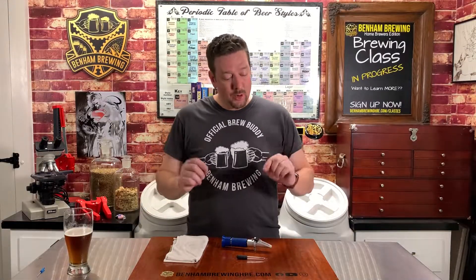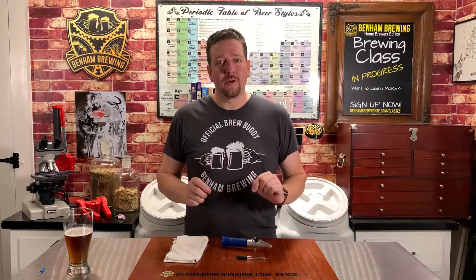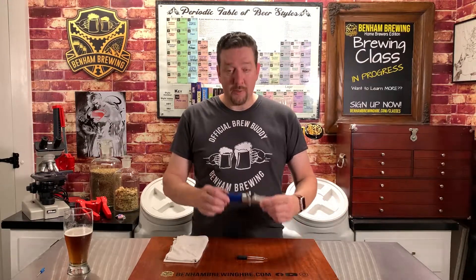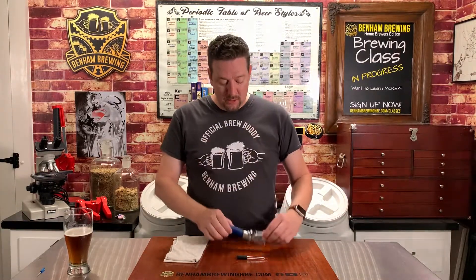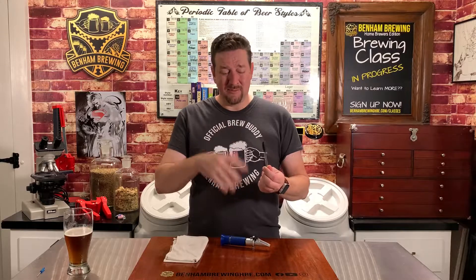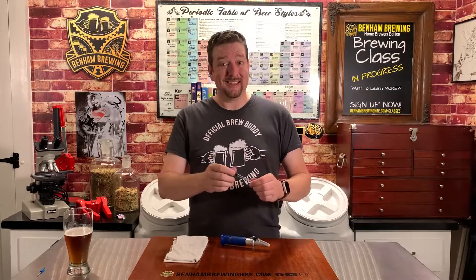Alright guys, let's talk about the refractometer. Quick disclaimer — this is a quick and dirty video, so we're going to be skipping over a lot of points in an effort to get you up and running as quickly as possible. First and foremost, what do you need? You need a refractometer to take your measurements. You're going to need an eyedropper of some kind. We use a glass one because I don't like plastic and hot liquids — I'm afraid it might impart some plasticiness into the beer.